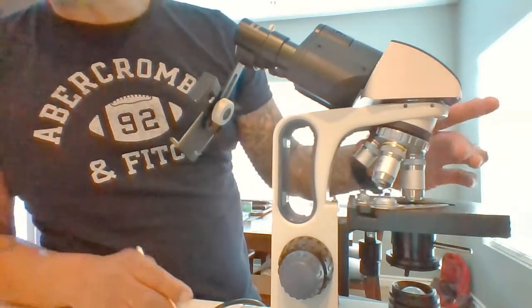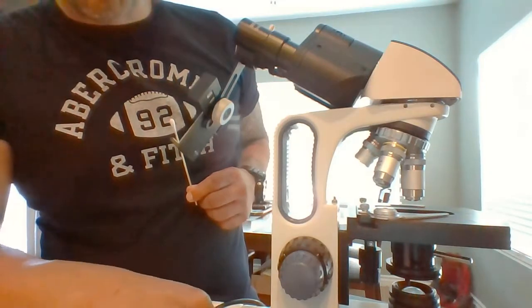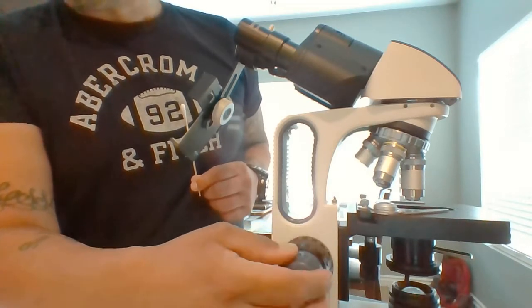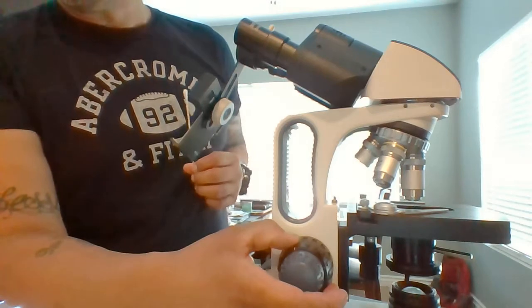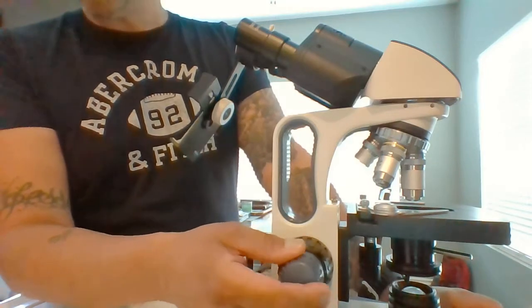We have the coarse and fine adjustment. The coarse is obviously moving the stage up and down. Here we have the fine adjustment, and the coarse adjustment moves the specimen in and out of view quickly, while the fine adjustment is used to sharpen the edges of the picture.